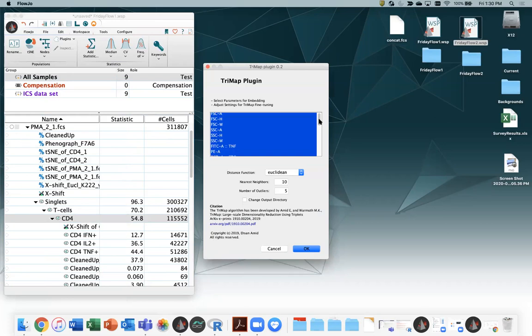You will get some kind of parameter selection. It'll generally highlight everything to begin with. We can go pick, and actually, let's take it back up. Yeah, okay, this is fine. This is fine since I did set up that one, and that'll make an easy comparison of one list that we actually have to run.